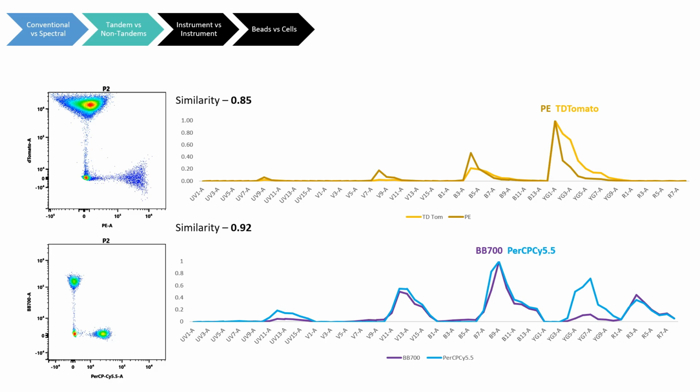My point here, however, is that your reference must be the exact same signature as the one in your sample. This is the basis of all rules in spectral cytometry. There are many ways to break Rule 1. We have just discussed one example of why, for the most part, you can't use surrogate fluorochromes in spectral cytometry.